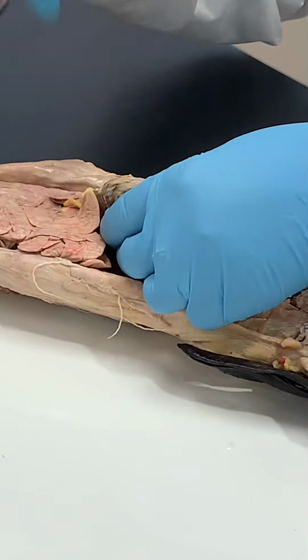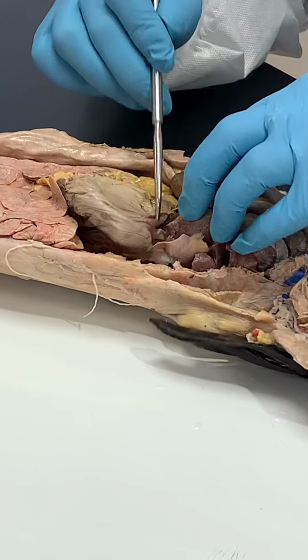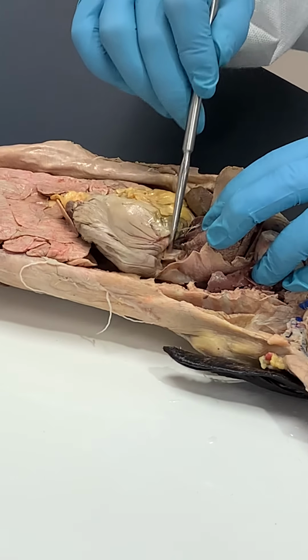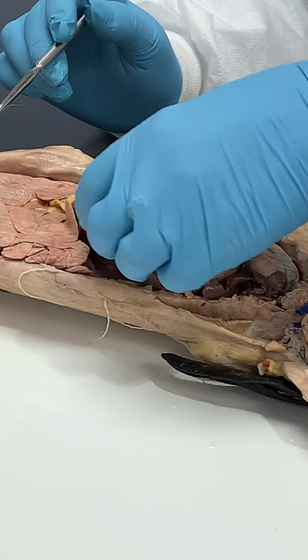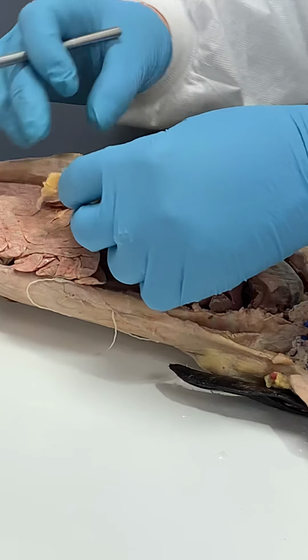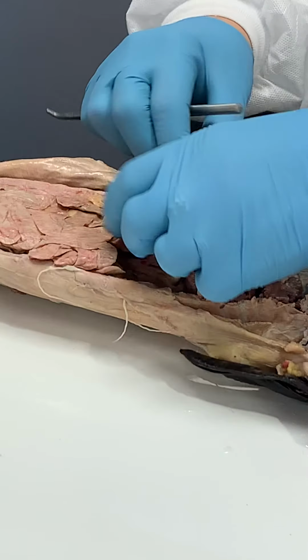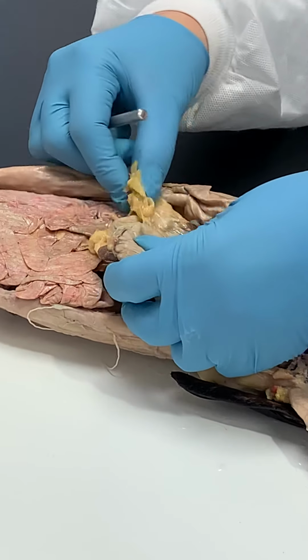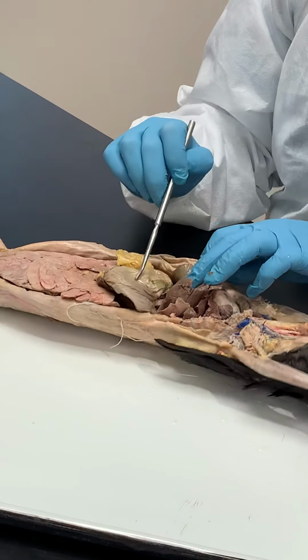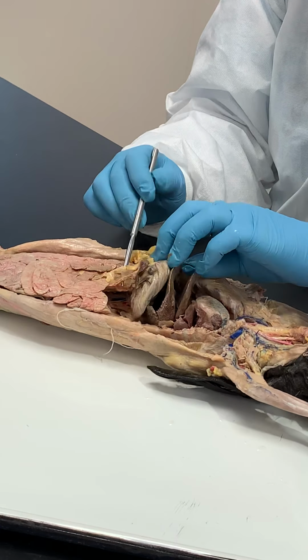Most of the time, these stomachs have food in them on these rabbits. So here's your stomach. Down in here is where the esophagus is coming in, right there. Right, so your cardiac sphincter would be right in that area. This is your greater curvature, and you see the fat here? This is the ever so lame greater omentum. Okay, that's part of the rabbit's omentum right there. Okay, there's a lesser omentum, but as I said, it's pretty lame looking. There's not much there. On a cat, it's much more obvious.